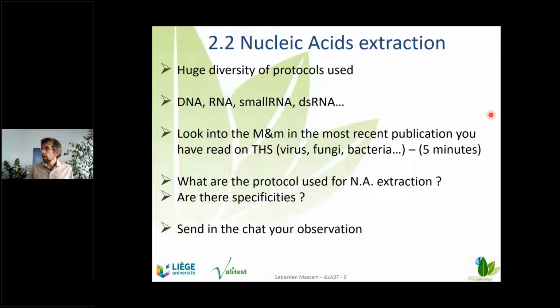There is one interesting point: it will depend on what we want to sequence, whether we use SMRT, one of the technologies, or Illumina, another technology. We'll go over the technologies after. It's true that some of the new technologies, and we will see them in a few minutes, can generate very long reads.